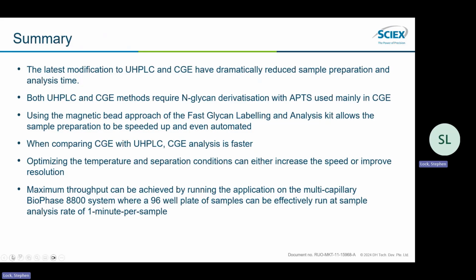And again, if you want to improve the resolution of separation, as I mentioned, you can optimize the separation by adjusting the temperature, which is something you can do on SCIEX CE systems, because we have liquid cooled capillaries, which allow you to adjust and control the separation temperature.